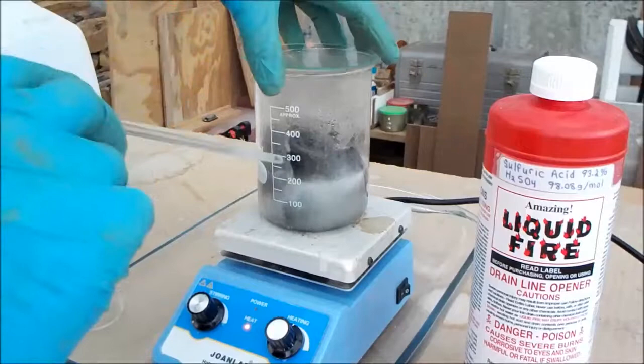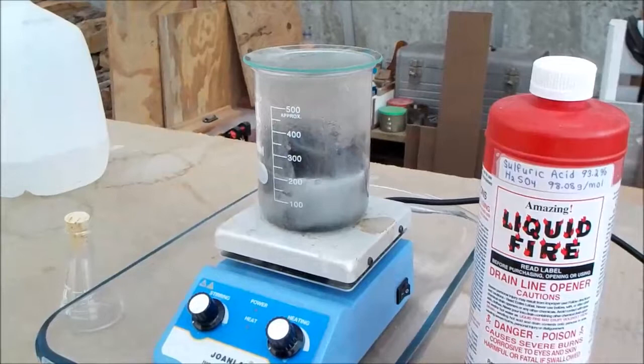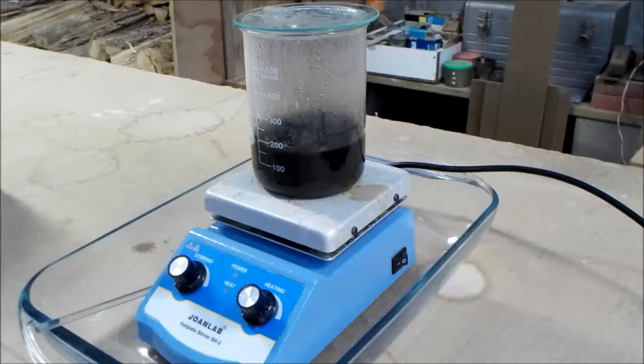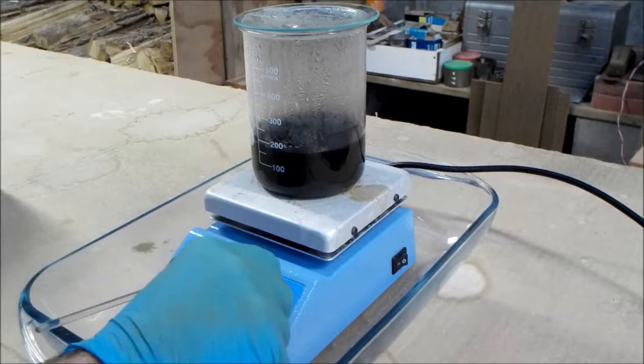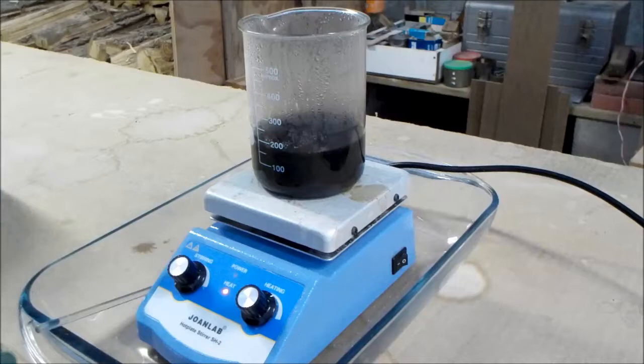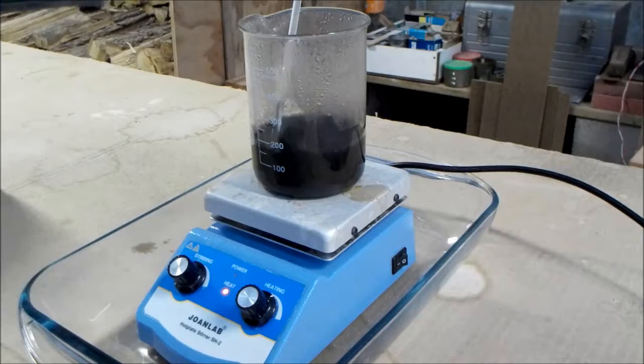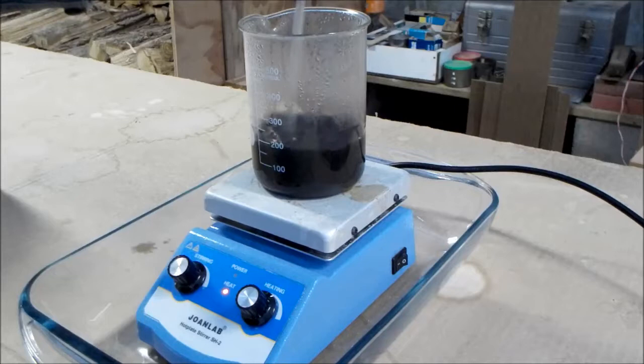At this point, I think it's self-heating, so I'll just turn the heat off for now. As the reaction slows, as the acid is used up, I'll probably have to turn the heat back on. It's been about a half hour, and the reaction has slowed considerably, so I'm going to turn on some heating now and give the beaker a little stir. There's still some undissolved steel wool, but much of it has already reacted. The last remaining bit always goes very slow, so the heat will help.